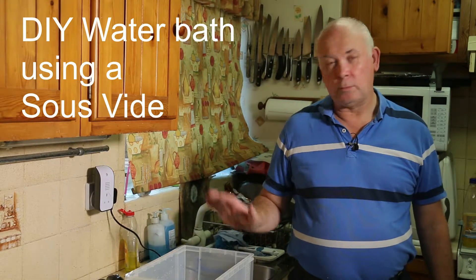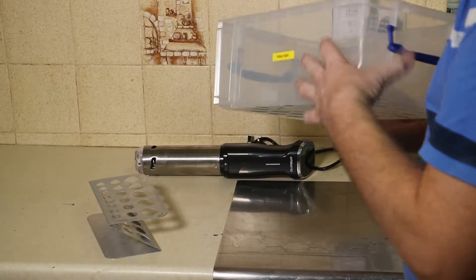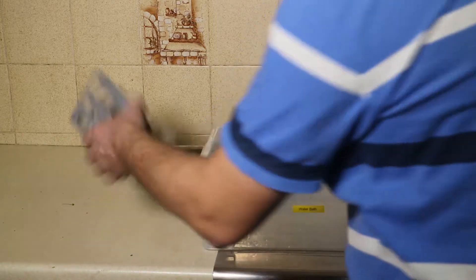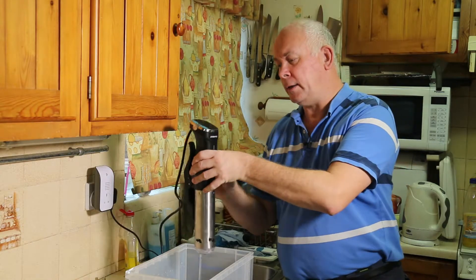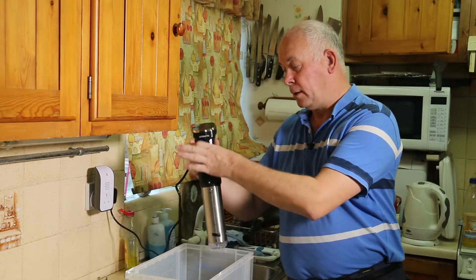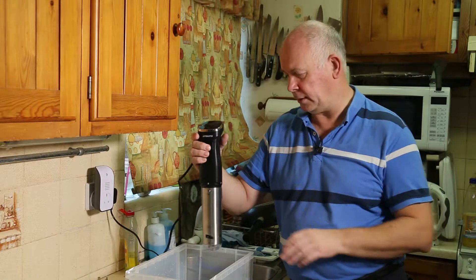I need a water bath but the price of these water baths is way above what my budget will allow, so as needs must I need a DIY water bath. It's actually a lot easier than I thought. What I've got is one of these really useful boxes — it's 9 litres — a test tube rack, and one of these things you can now buy in many shops: a sous vide. It does exactly what I need, and it costs anything from around 50 pounds up to about 110 or 120.